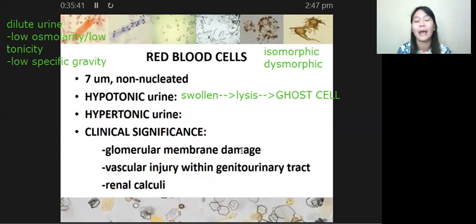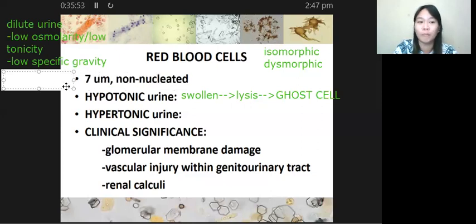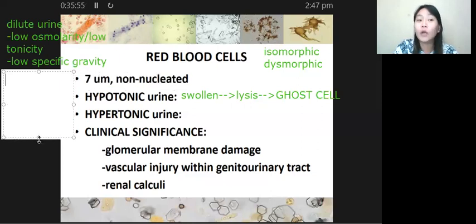Okay, ghost cell. So, in one of the references that we have in clinical microscopy, may isa pang term ang ginagamit in order naman to characterize red blood cells that are present in unfresh urine sample. Okay? So ano yung term na yan na ginagamit natin?